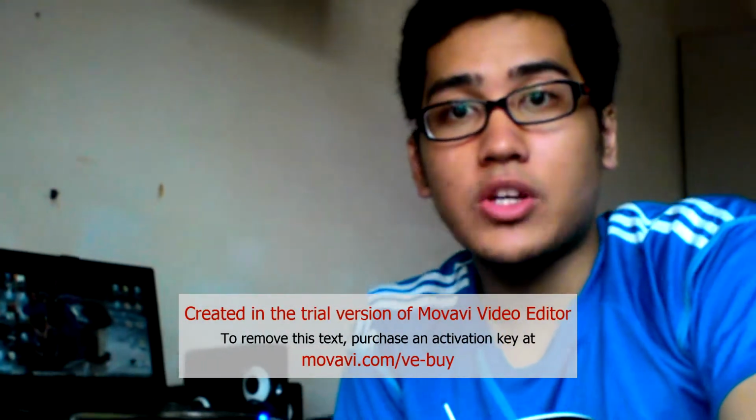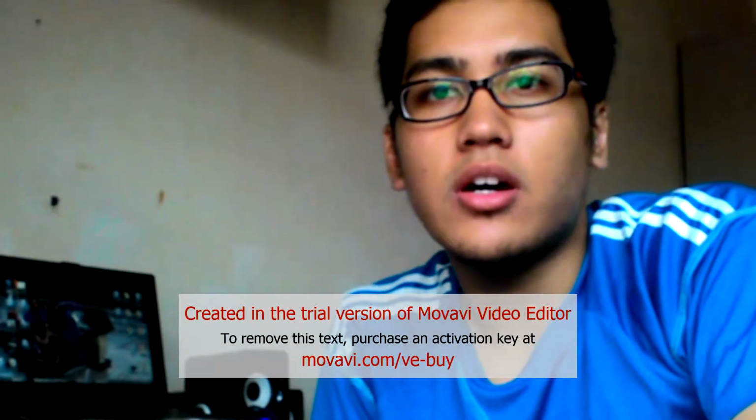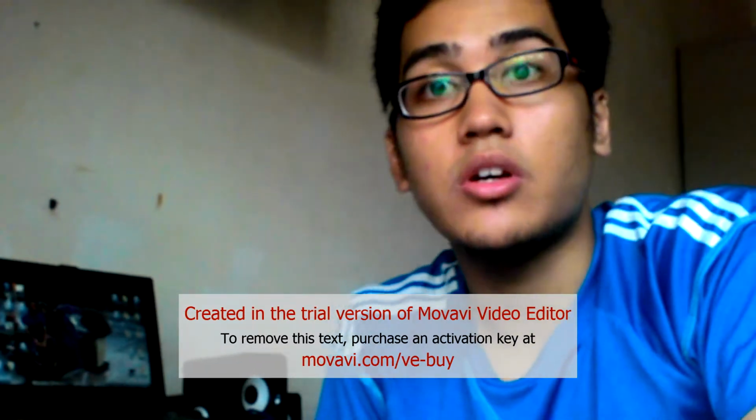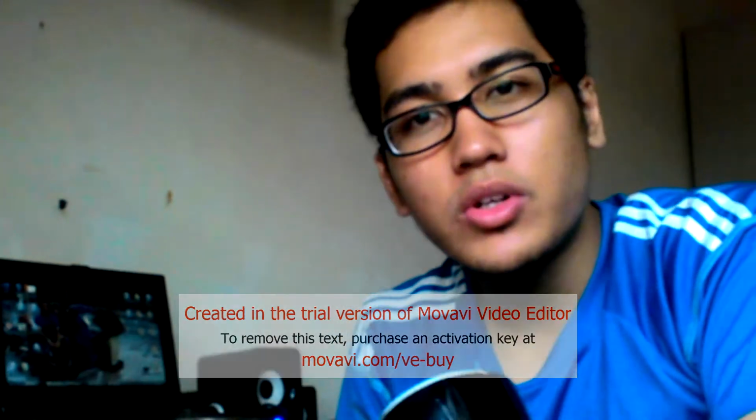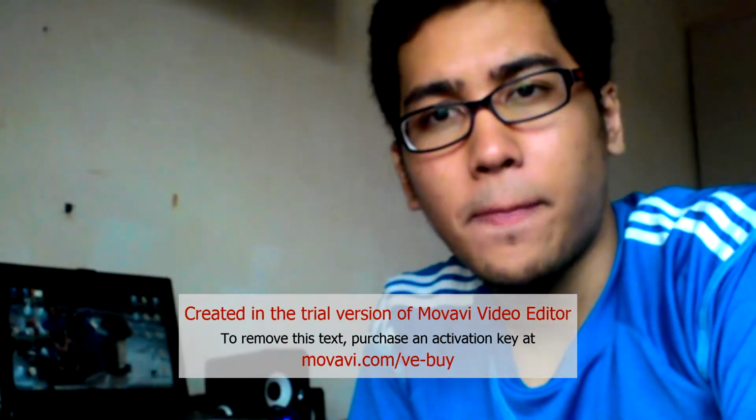Interesting, yet it sounds so complicated to me. Dr. Azaha, would you mind to explain the features in more details? About that question, like I said just now, the crucial parts of the tubular PBR include the solar receiver and also the mixing unit. But I'm going to add another one, which also contributes the most in optimizing the yielding of the algae production, which is lighting application.